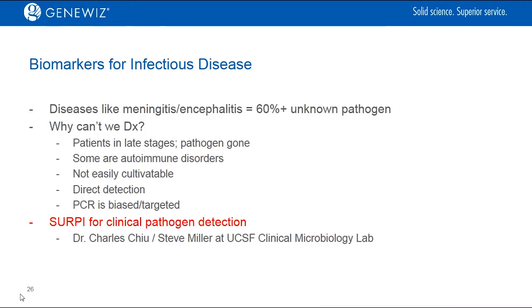I've separated the application of metagenomics in infectious disease from other disease states because one of the most powerful emerging applications for metagenomics is in pathogen detection in a clinical setting. So we can use metagenomics to develop point-of-care assays which may be more powerful than our current diagnostics, but we can also use metagenomic sequencing and bioinformatics techniques as well to diagnose.